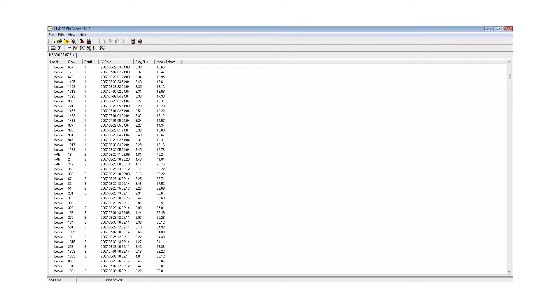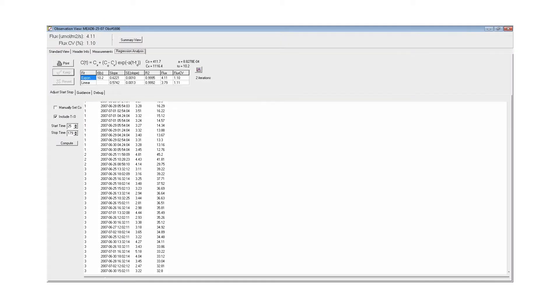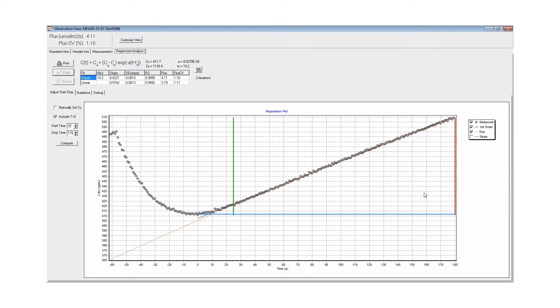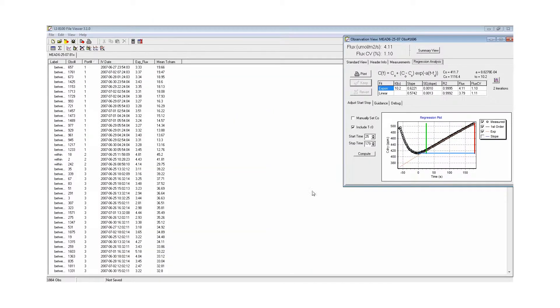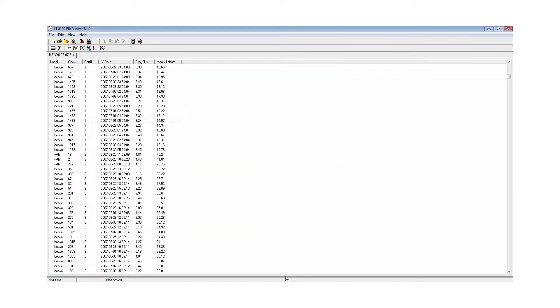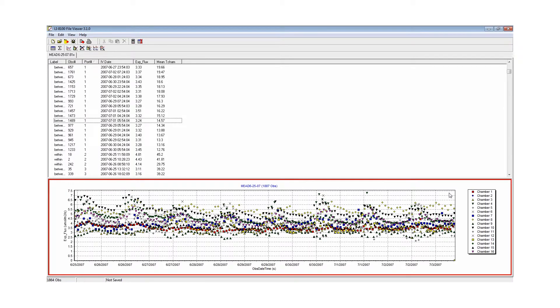You can view individual measurements, as well as graph and compare fluxes between multiple chambers.